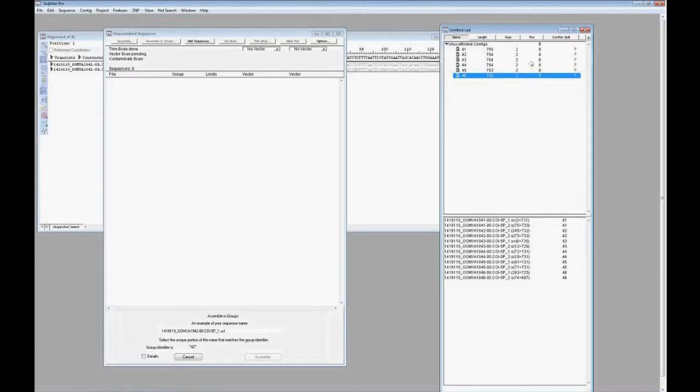And then, like for a multi-sample assembly, you'd want to do that just to make sure you're not corrupting your existing samples. But let's say you wanted to actually add to these samples, you wouldn't need to lock them. In addition, you've seen here the assemblies all run fairly quickly, so you could just start your assembly from scratch and dump all your data in. So either way you want to go.